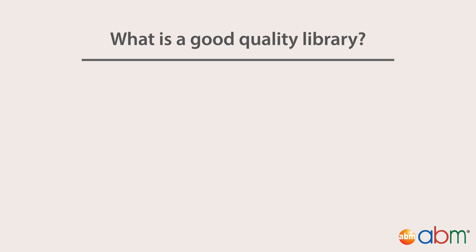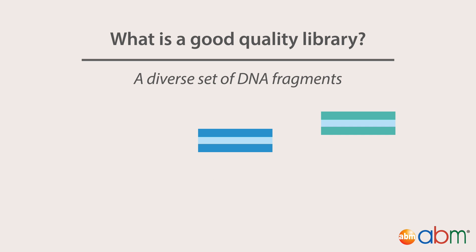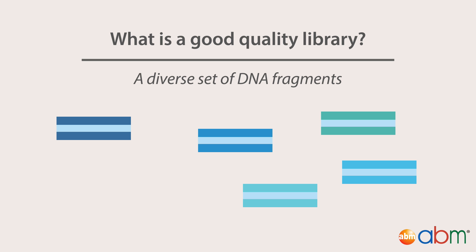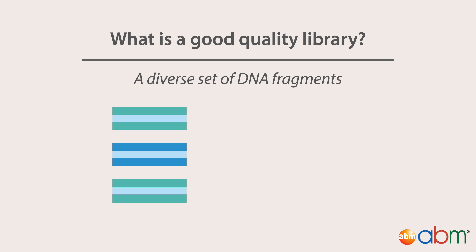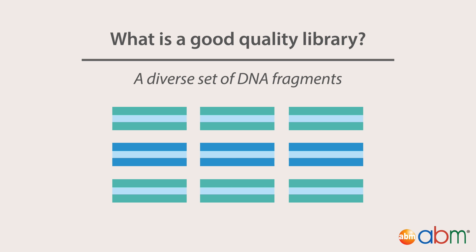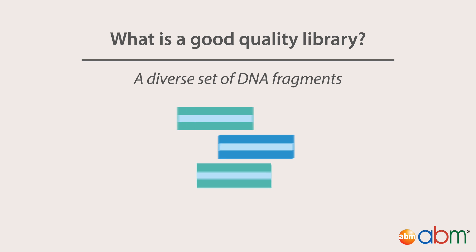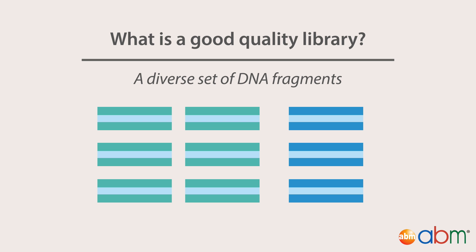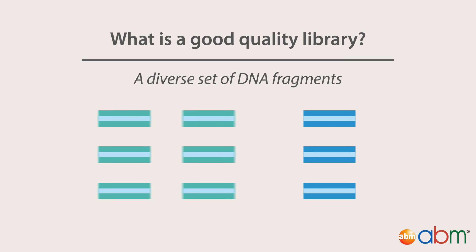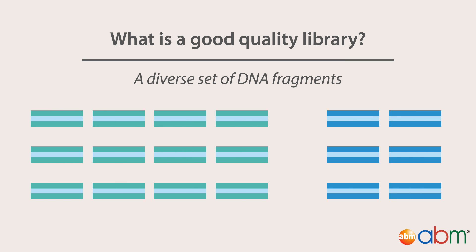In terms of quality, a good quality library is one that has a diverse set of DNA fragments with minimal duplicate fragments. This is important because during PCR amplification, duplicates of fragments will be generated. The consequence of duplicate fragments is that the sequencing reaction will be biased towards these fragments, rather than having a wide range of fragments sequenced. The same fragments are sequenced repetitively, resulting in overrepresentation in the machine output.